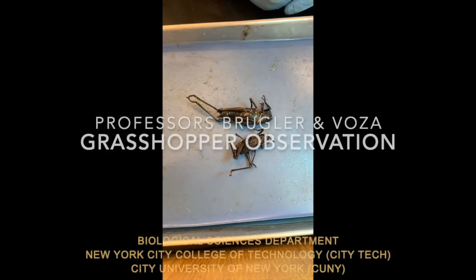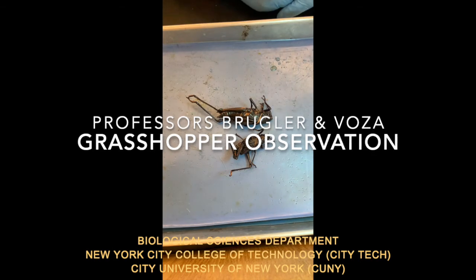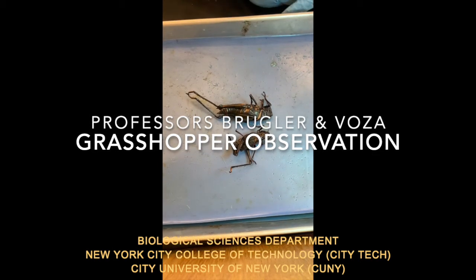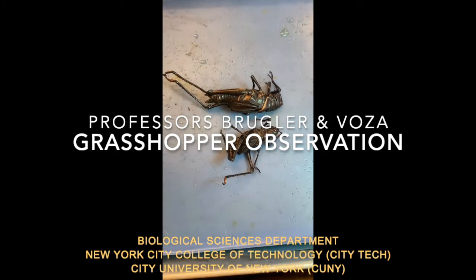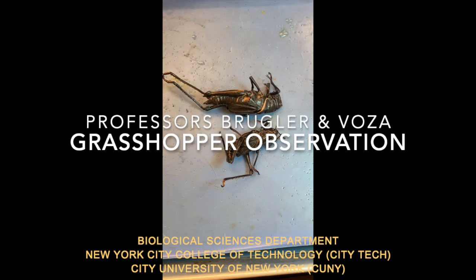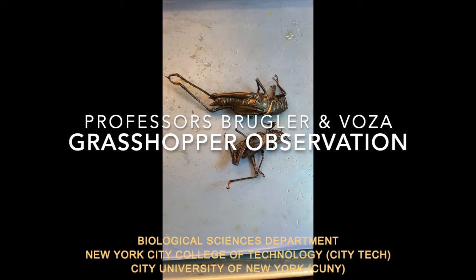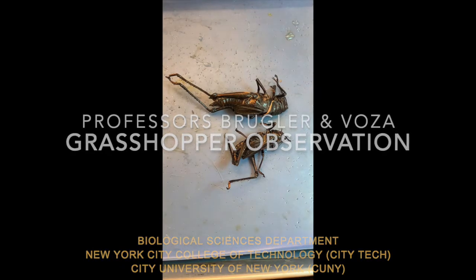Hi there, Professor Voza and Professor Brugler from City Tech, Biological Sciences, and today we're looking at an arthropod. And no, these are not cockroaches — I wouldn't be able to touch them if they were, even dead. So these are grasshoppers? Grasshoppers! Locusts? Some combination thereof.